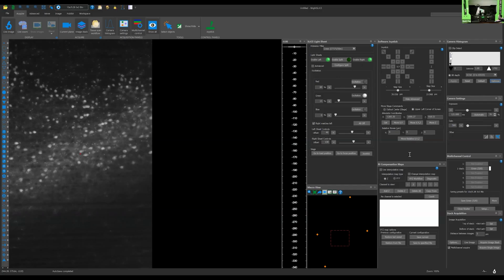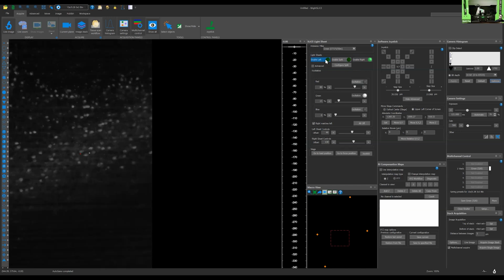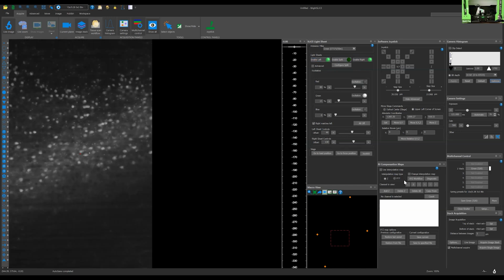They may be in our axial or our Z axis, stacked on top of each other. And what that's going to produce in the resulting image is actual doubling of the structures, which we want to avoid if we're acquiring with two light sheets. So here, I should see structures get brighter, but I don't want to see new structures populate. And it seems like we've achieved that.